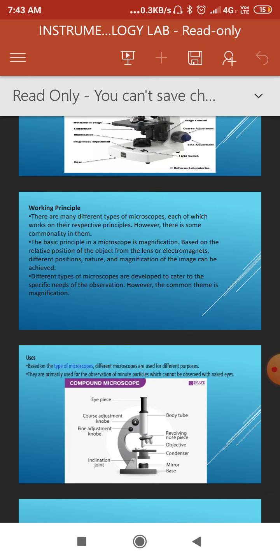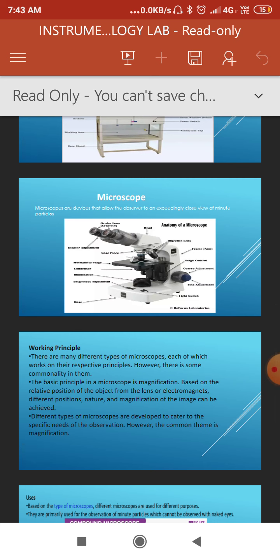The complete microscope figure shows its parts organized into systems. The support system consists of the base, pillars, handle or arm, body tube, stage, and nosepiece. The adjustment system includes coarse adjustment and fine adjustment controls.